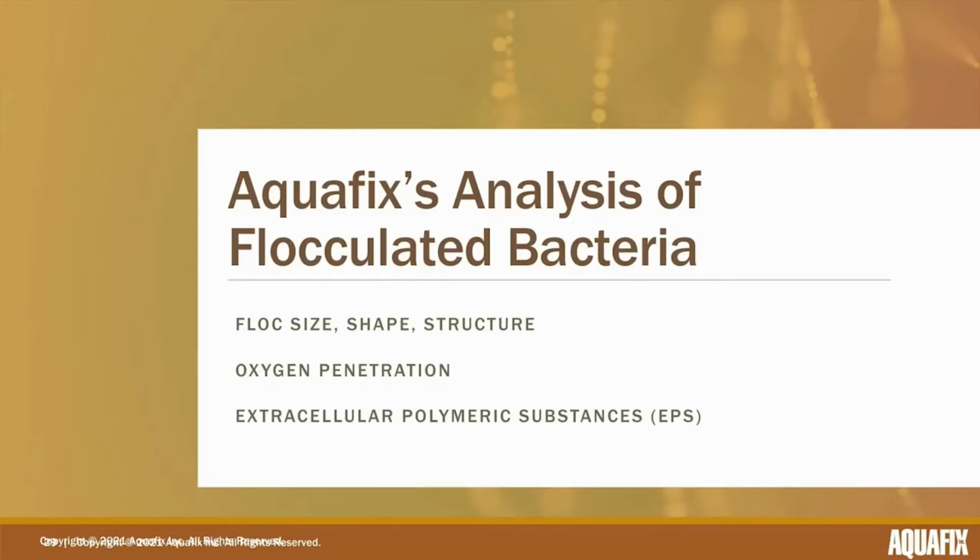Our overall analysis of floc includes floc size, shape, and structure, as well as oxygen penetration and EPS levels. Knowing this information helps us to determine the overall health of a plant. Now let's move on to metazoa and protozoa.